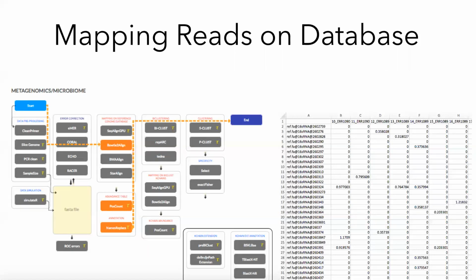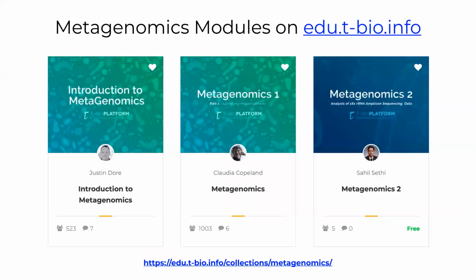So we generated this table of abundance, and we talked briefly about what that would mean. We can look at the abundance numbers, we can filter them, and we can ultimately find the most abundant species or phyla that we find in the data.